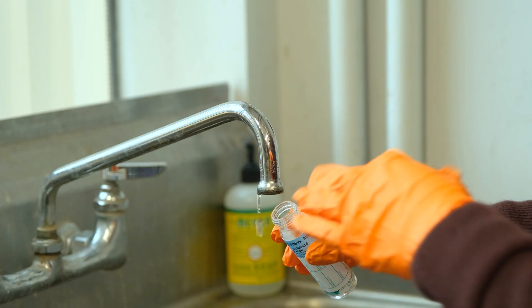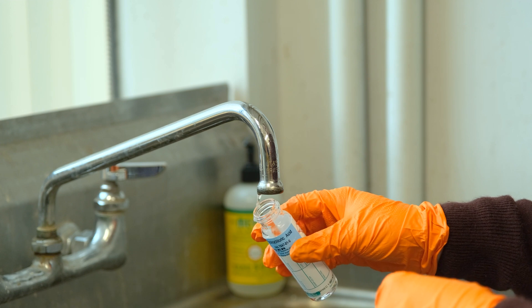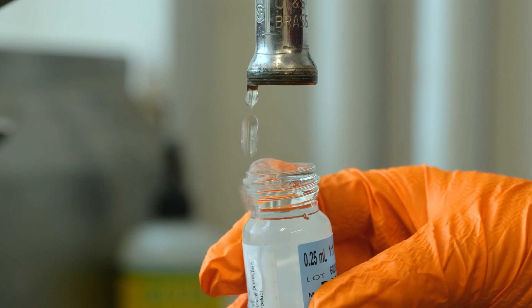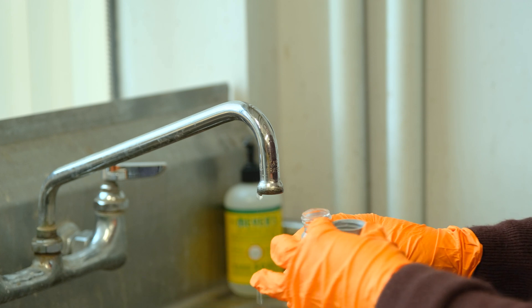When you put the sample under the tap, you want to put it in at an angle so that the water is hitting the side of the vial as it flows in. When filling the vial, you want there to be a meniscus at the top, and then put a little bit of water in the cap so that there's no airspace in the vial.